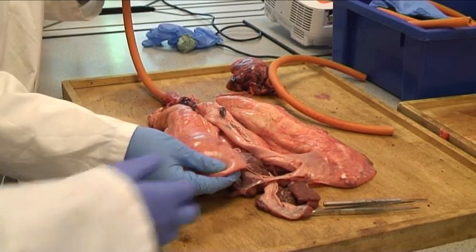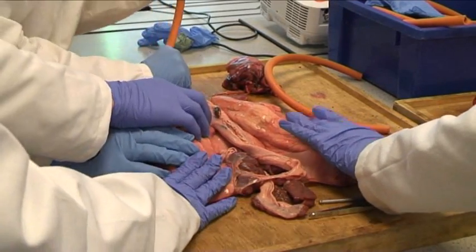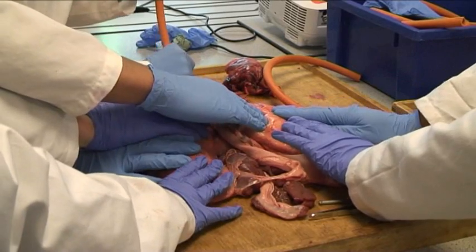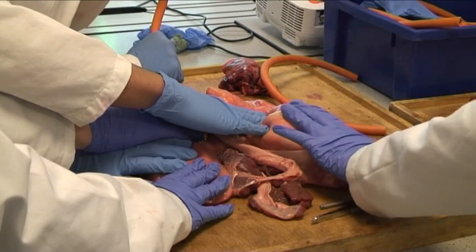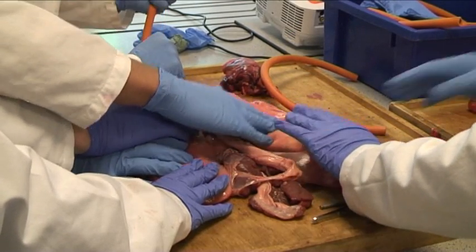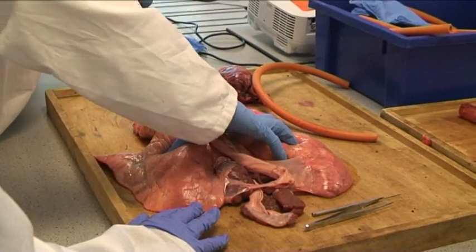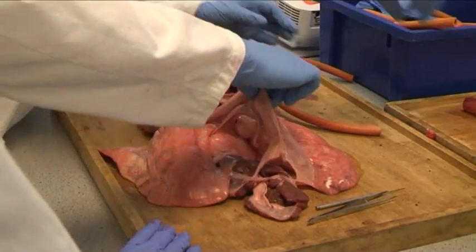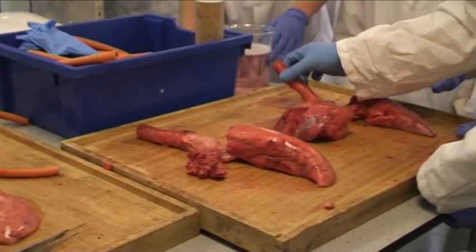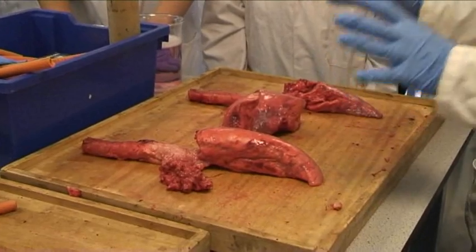Somebody feel them — have a feel of it, nice and soft, silky. Okay, are you ready? Keep your hands on — ready, grab a bit of lung. You can feel that; they automatically come out anyway because the muscles just expand.